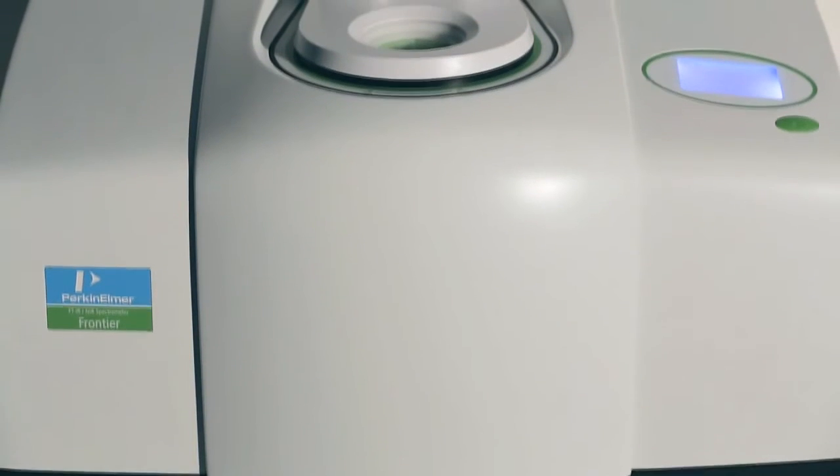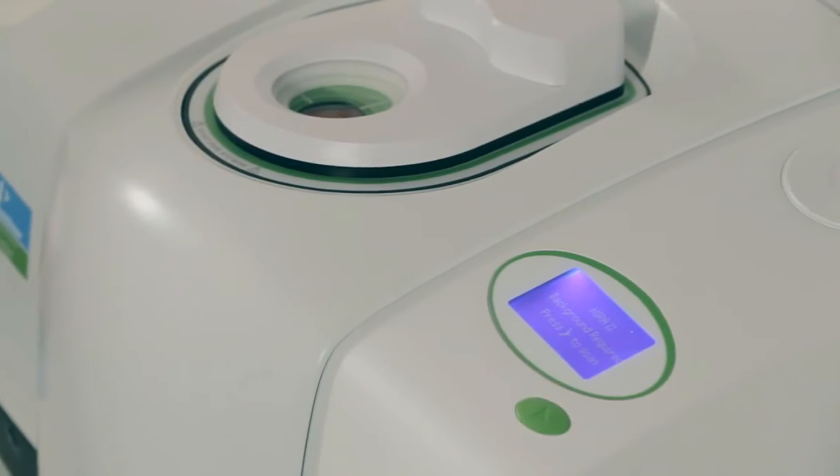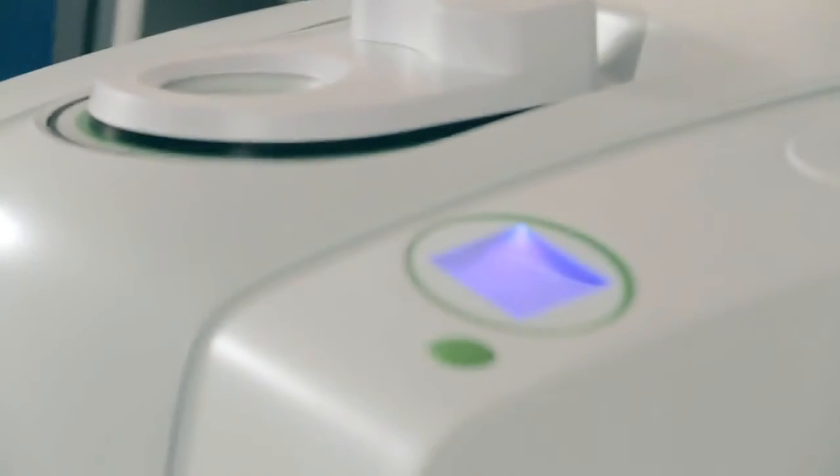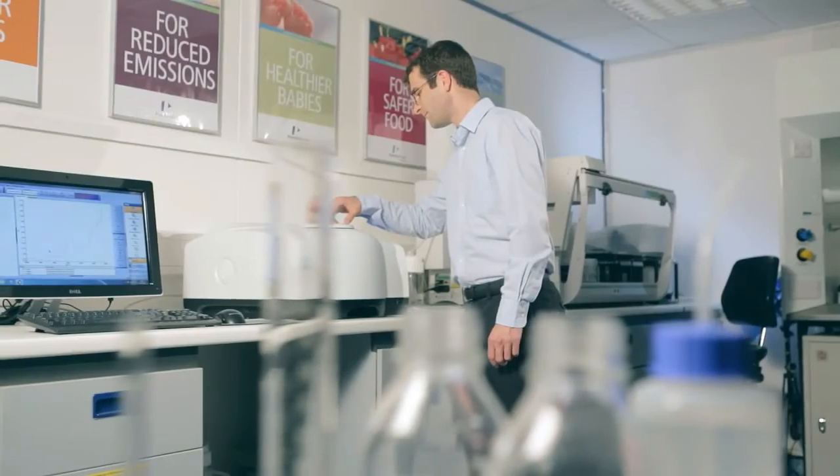This example shows how you can take near-infrared spectroscopy beyond quantitative methods for nutritional properties. Adulterant screen software from PerkinElmer lets you create simple, sensitive, and easily adaptable methods to extend your screening capability to address both present and future threats to food safety.